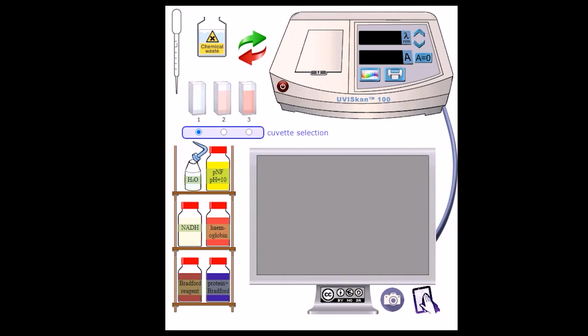Okay, so my experiment is going to be the use of a virtual spectrophotometer to get the concentration of hemoglobin, or the absorbance, because absorbance and the concentration of some chemicals are directly related. I already made my solutions. First, we need the blank solution. This consists of only 3 milliliters of water.